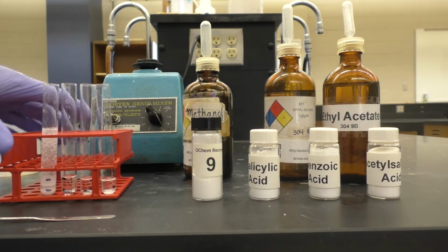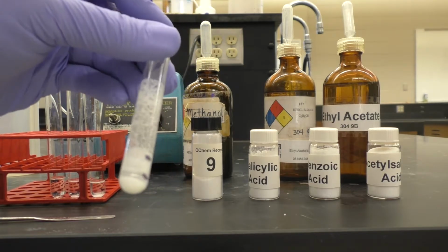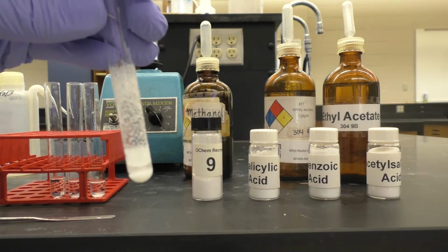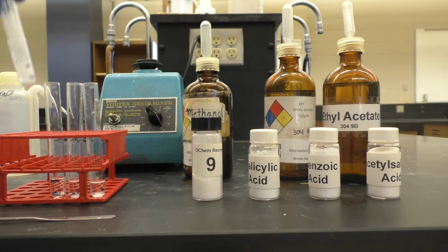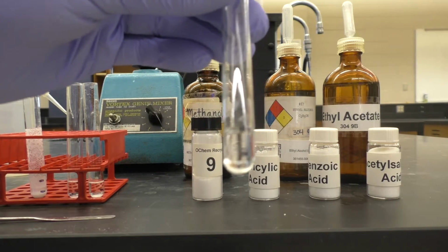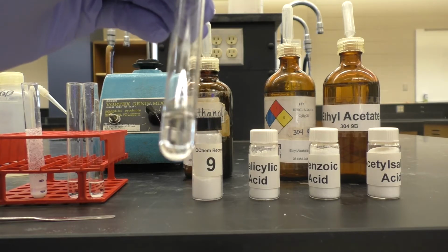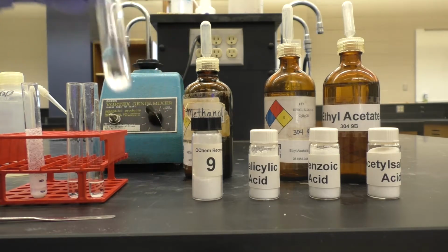All right, so at this point, let's compare them. So first, the water we see is entirely insoluble. In fact, it's brought material up along the walls just because it's so insoluble. So there's essentially no solubility in water at room temperature. Methanol is pretty much completely dissolved. So this would not be a good solvent to try the recrystallization in because we won't be able to get it to crystallize back out, since everything is almost fully dissolved at room temperature.